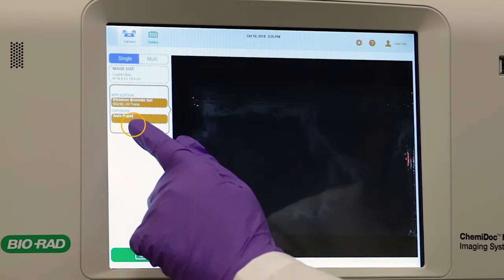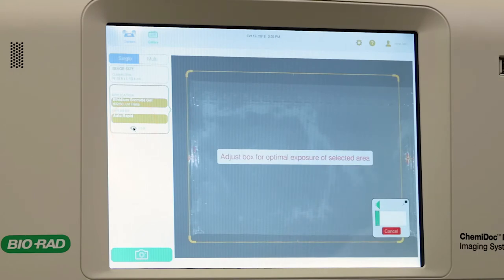If desired, you may take a preview of your image and set your region of interest. This can be very useful for excluding very bright areas that you won't want to quantify, such as your marker.